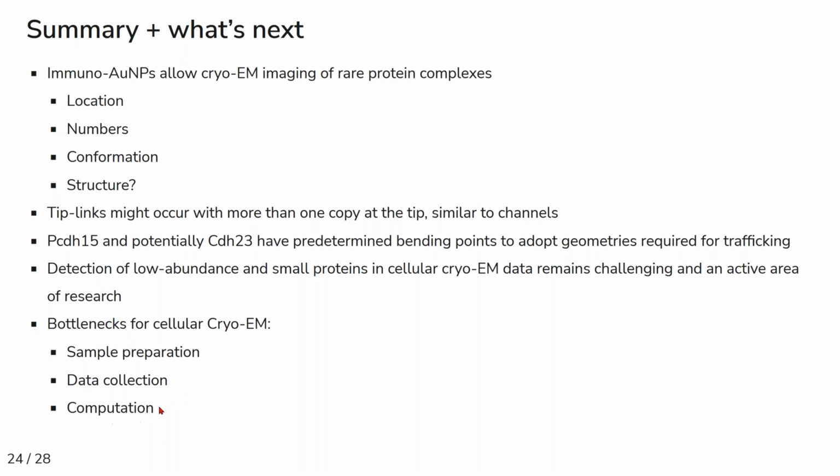And lastly, and I think that might actually be one of the major bottlenecks, is the computational side. It's becoming increasingly challenging to, first of all, store all the data we're generating, and then also process it all. And in this study, basically all the identification was done by me personally looking at things and manually annotating and identifying them.